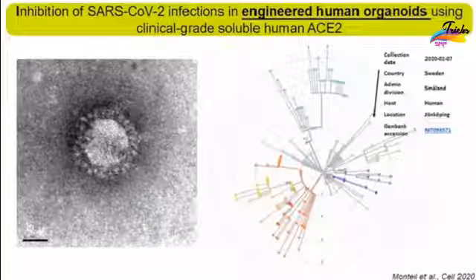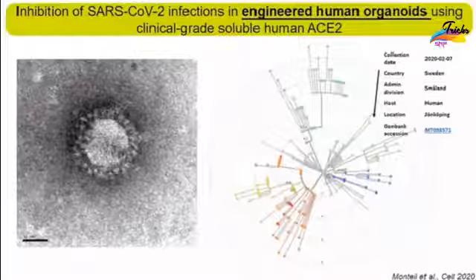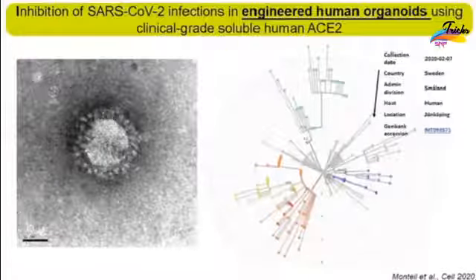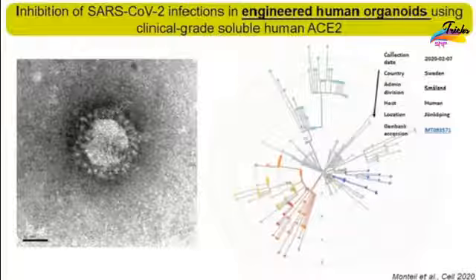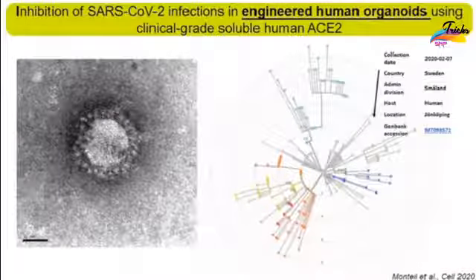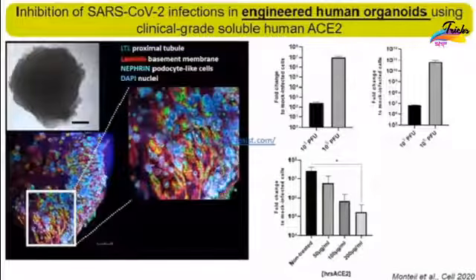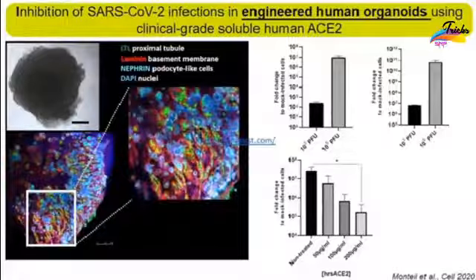The group of Ali isolated SARS-CoV-2 from a patient with confirmed COVID-19 disease, and after successful culture of the virus, this was sequenced and further analyzed, of course, by electron microscopy, and this image shows the prototypic coronavirus morphology. At Karolinska Institute, Mirazimi performed the infections of kidney organoids that were monitored for infection with SARS-CoV-2 particles, and further assayed RNA using qPCR.